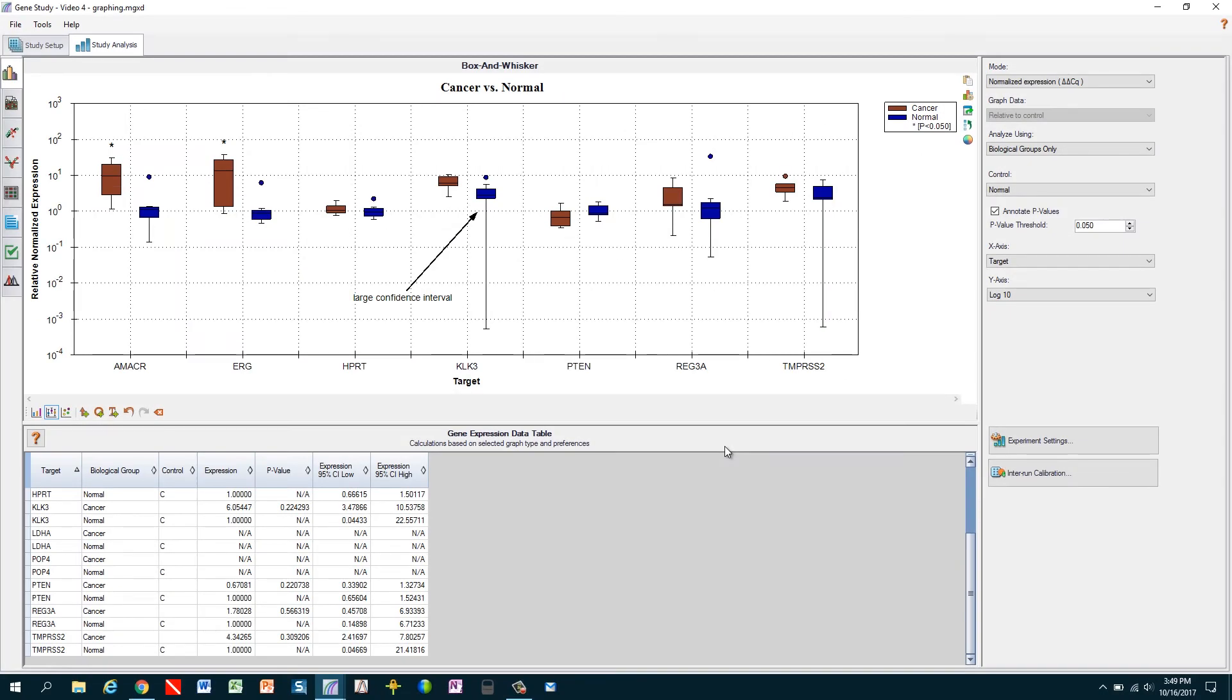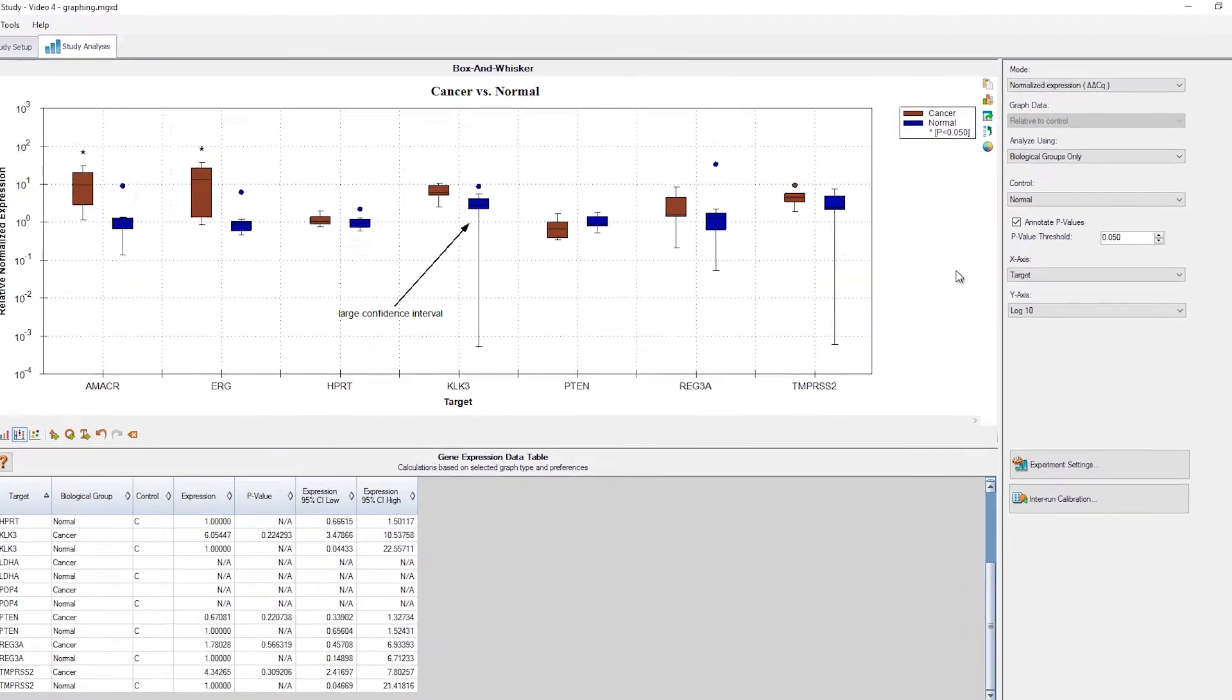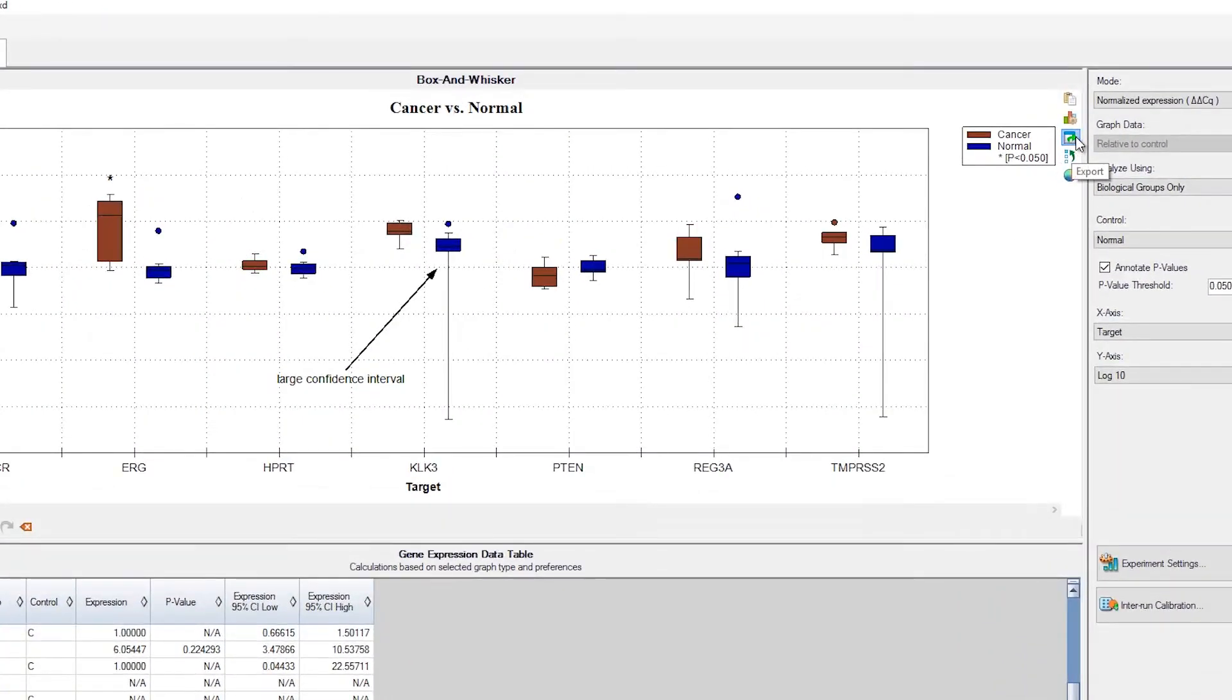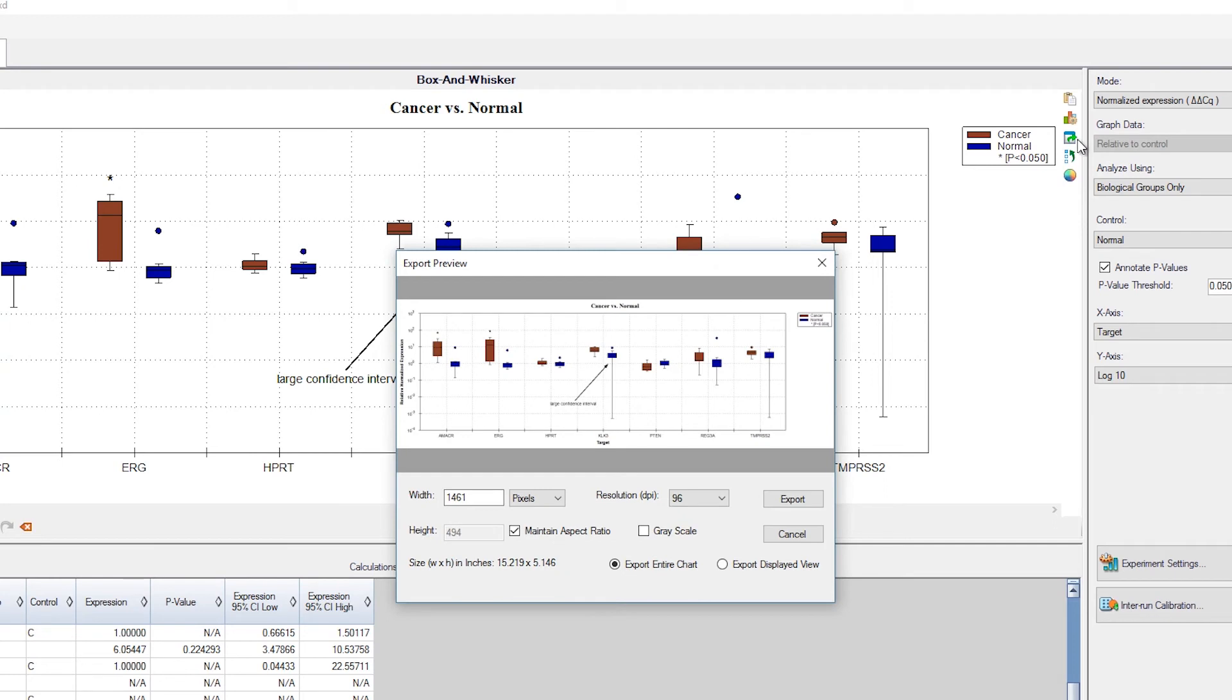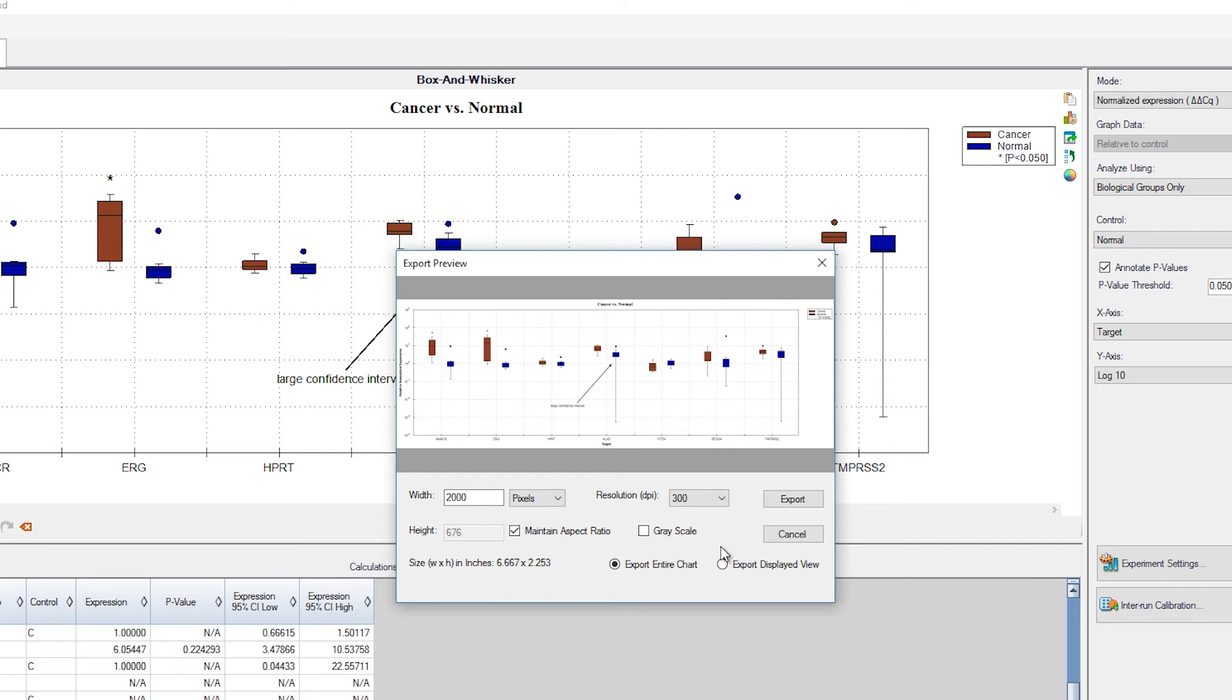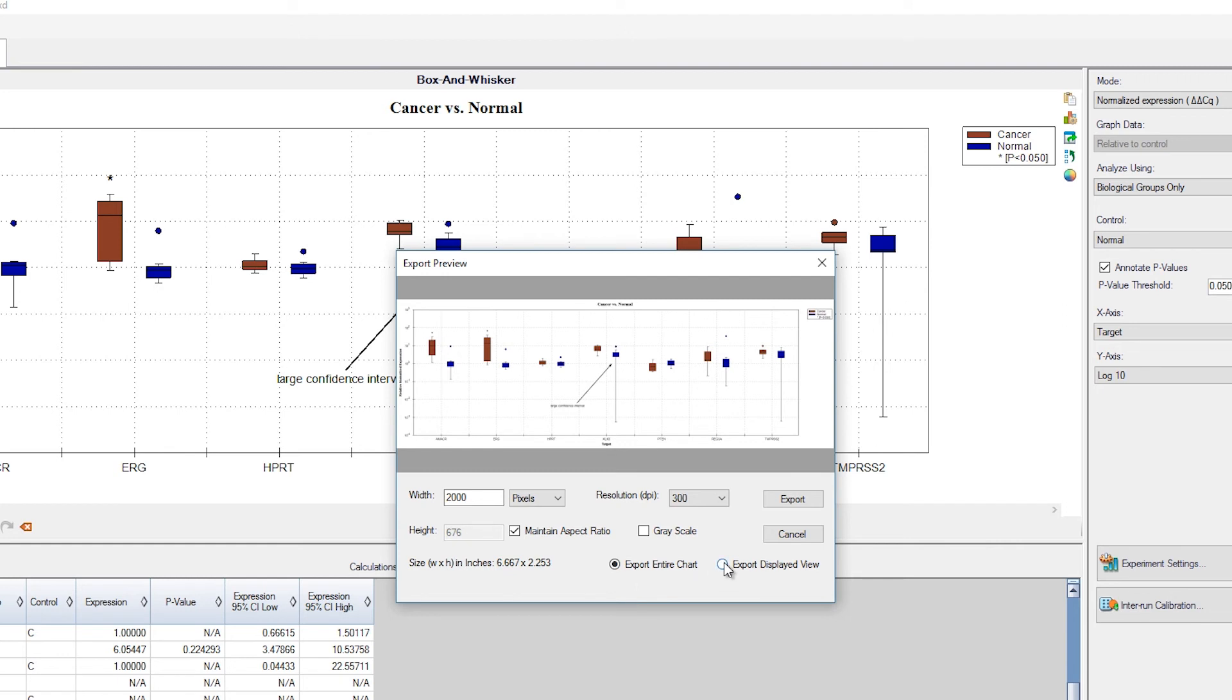Finally, we have our graph set perfectly and we can export at any size or resolution. Clicking on the export button brings up options for how we'd like to export. We can choose any width and height for the graph and set our resolution. Here we'll choose 300 dpi or dots per inch, which is the resolution generally preferred by print publications. We can also export in either color or grayscale. And we can choose to export the entire chart or, if we have zoomed in on part of the graph, we can create an image with only that area.